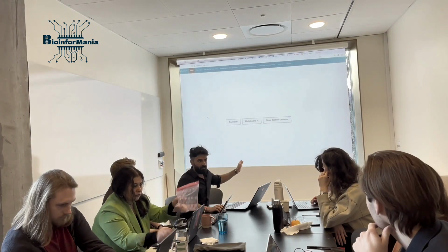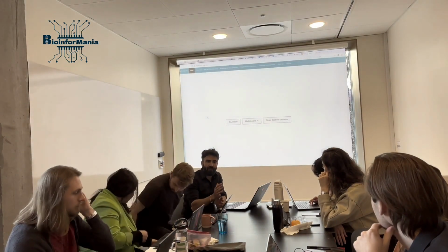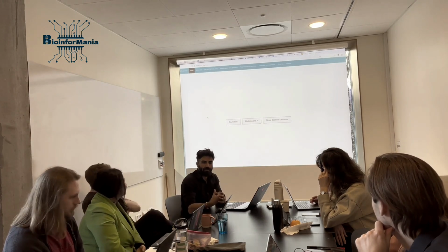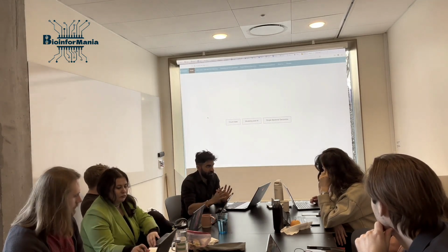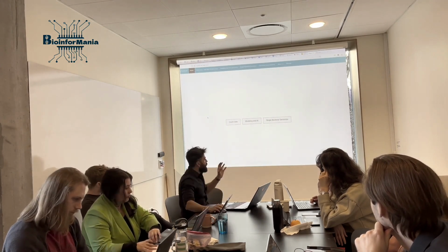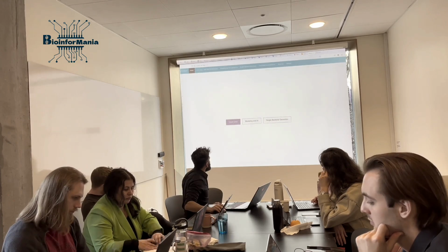So this is Microloop. Microloop is the app that I developed for this 16S data analysis, okay? Once you have your OTU table or ASV table, your metadata, your taxonomy table, and everything ready, then you can bring it to the count data here.